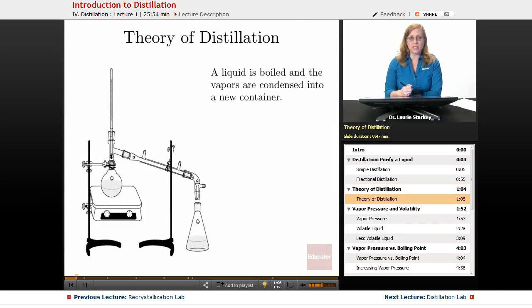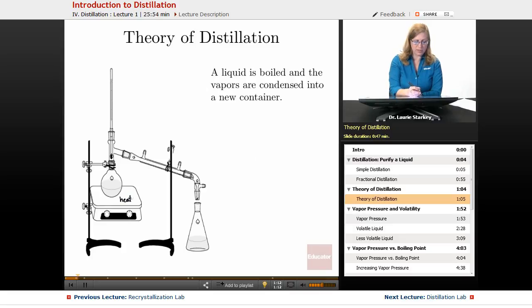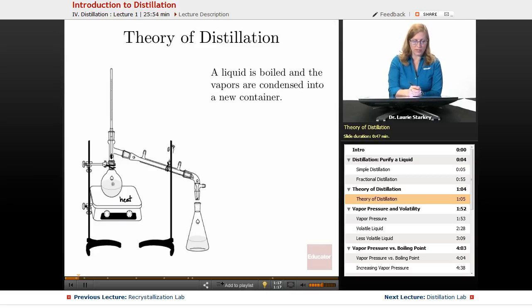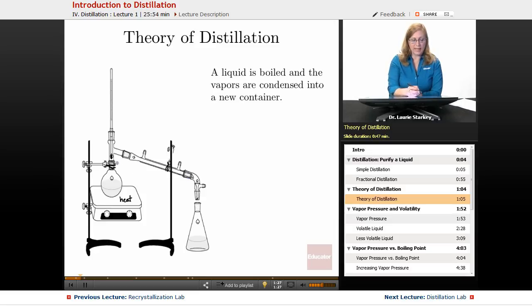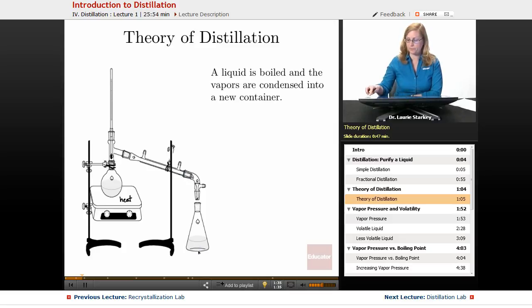So what does a distillation look like? Essentially, we have this setup here. This is some kind of heat source — either a heating mantle or a Bunsen burner or something like that. We're going to boil this liquid, the vapors are going to travel up here, we're going to record the temperature of those vapors, and then they're going to go into this water condenser, which cools them down, causing those vapors to condense into a liquid. That liquid is then collected into a new flask, a new container.